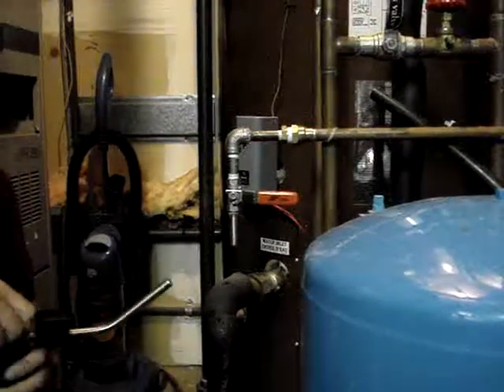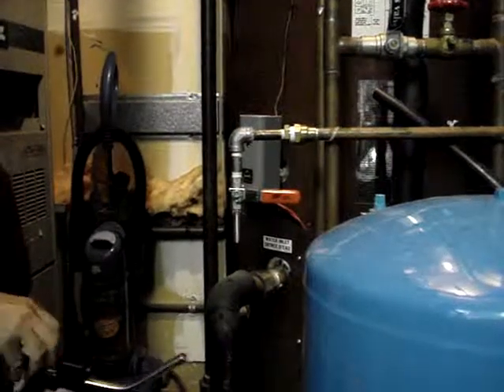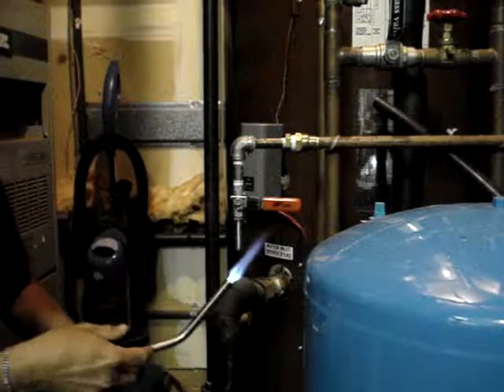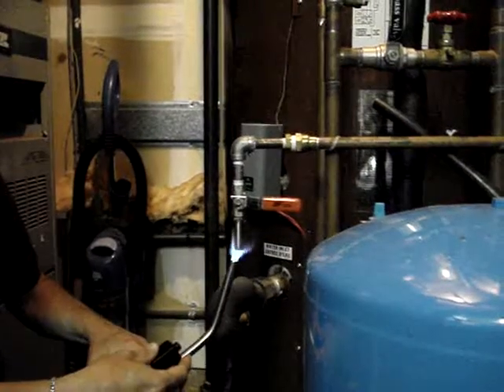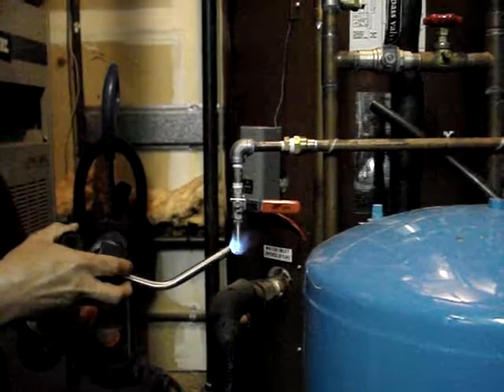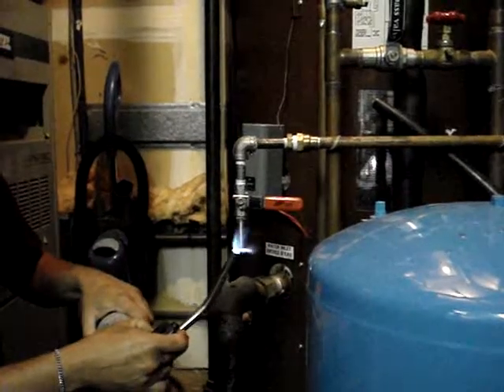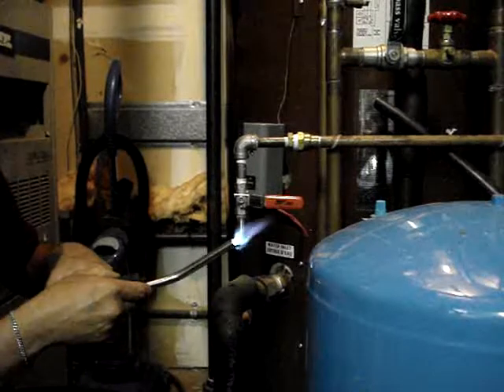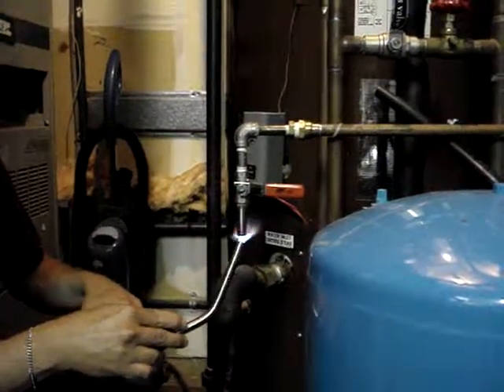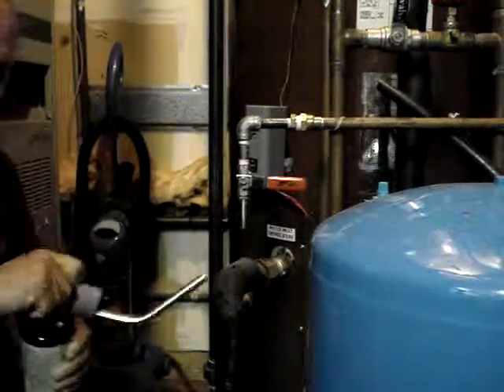Then you want to heat it up really well with a propane torch, making sure you get right up inside all the surface areas. No bacteria is going to survive that heat.